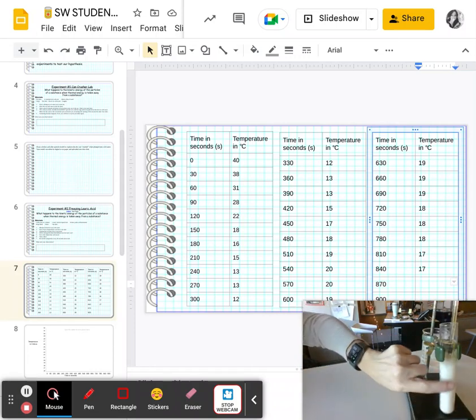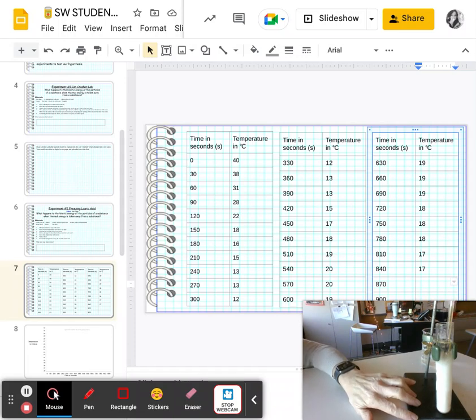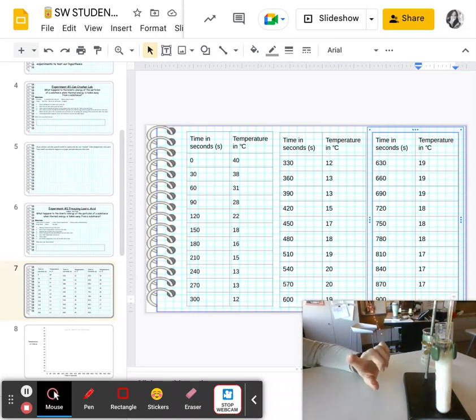Okay, so I've taken it out of the cold water. So now the energy, it's very cold, okay? As we can see, right now, it's at 17. It's very cold though. So now the energy transfer is a little bit different. So instead of the lauric acid giving its energy to the cold water, the air around it, which is warmer, is giving energy to the lauric acid. So we're not going to run this long to see it go up to room temperature. Right now it's up to 18. So it's heading its way back up to room temperature.